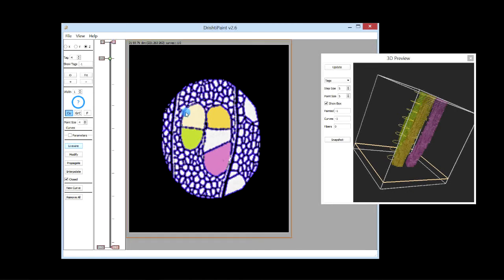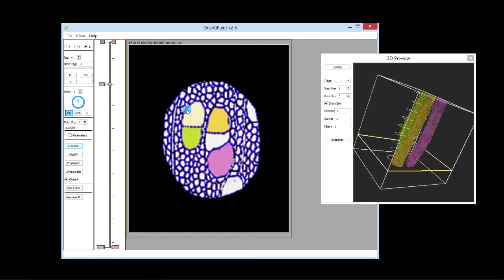So this is the curve, press spacebar, and the curve is selected. So here it is. I am pressing the spacebar. As you can see, this curve is selected. Similarly here, spacebar, this curve is selected, and so on. Now, in order to select all the curves within a particular range, so if I want to select curves between this range and say this range, what I do is use spacebar along with shift key. So shift and then spacebar.